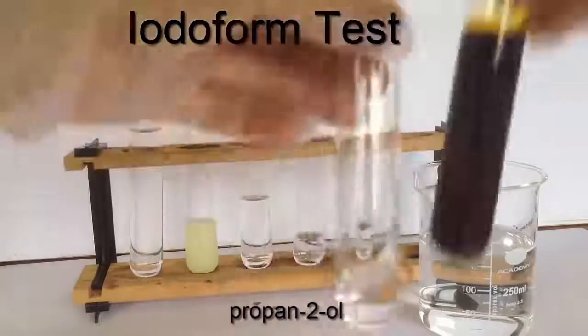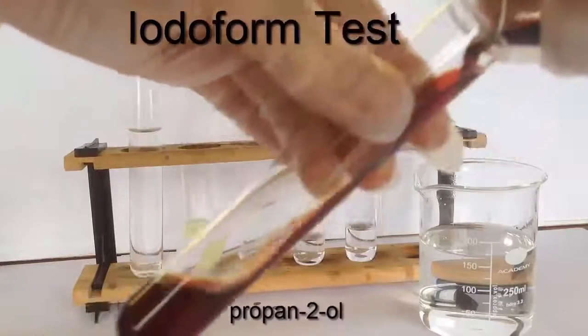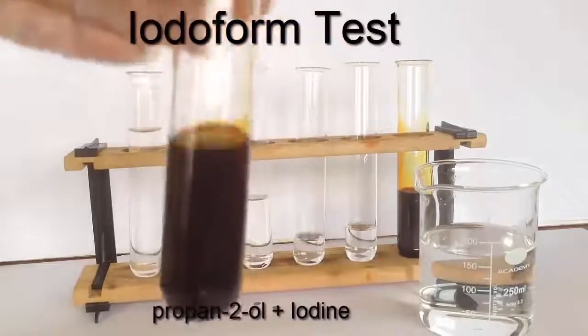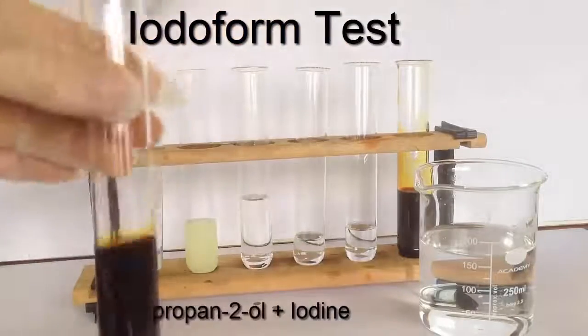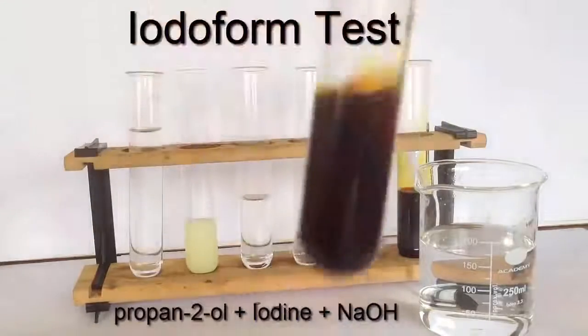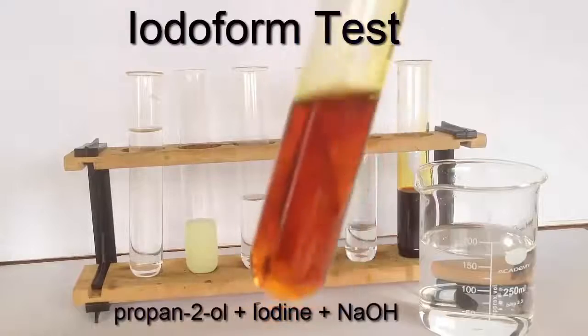So the position of the OH group on the 3-carbon chain is different. It's on the middle carbon rather than the outside carbon. So again, I've added my 10% iodine solution, and now I begin to add slowly with shaking the 2 molar sodium hydroxide solution.